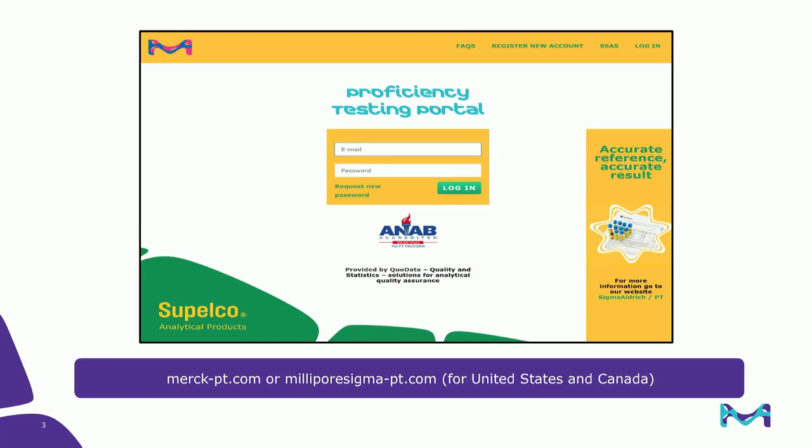We have taken your feedback shared with us over the years and used this to help improve our service to you. With this new portal, you will find new features including your methods now saved as default, graphical reports, the option to trend your data, as well as the ability to expand and collapse your items on the data entry screen, which will allow for quicker loading times. This presentation will go through each feature step by step. If you would like to skip straight to how to enter data, please go to slide 36.